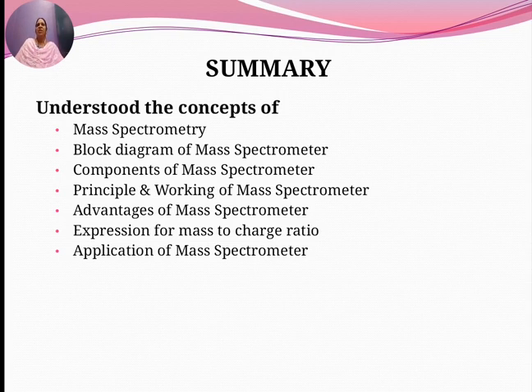The different stages in a mass spectrometer are, first, the ionization stage, where ions are produced from the sample. The second stage is the acceleration stage, where the ion beam is accelerated between two parallel plates maintained at high potential, with a slit between them through which the ion beam passes. The third stage is deflection, where the ions are deflected by the magnetic field surrounding the instrument.